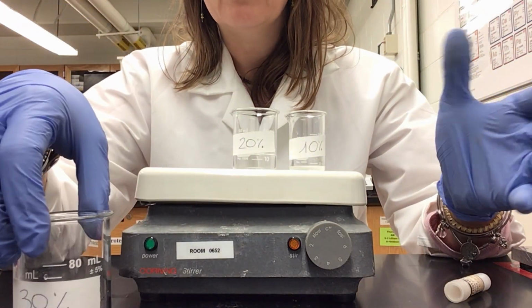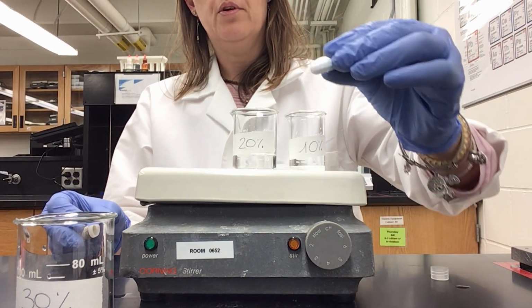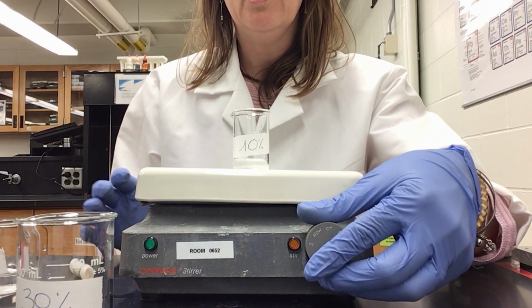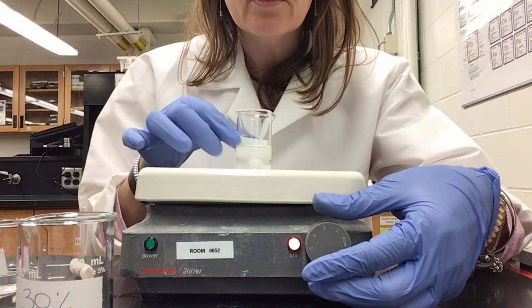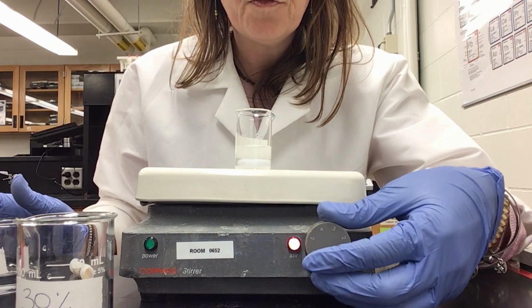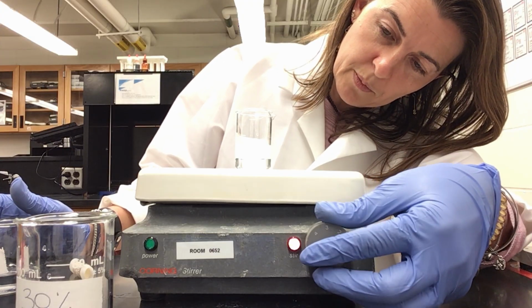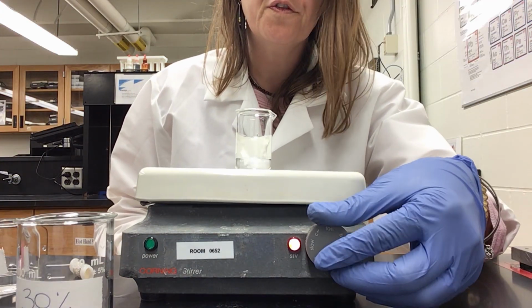Now, to make things easier, I decided to use a stirrer. So I'm gonna put a magnetic stirrer here, and I am going to start stirring it. Don't go too wild with the speed, just enough that the solution is completely clear. There's still some sugar on the bottom, so I'm gonna stir it some more. That should be enough.